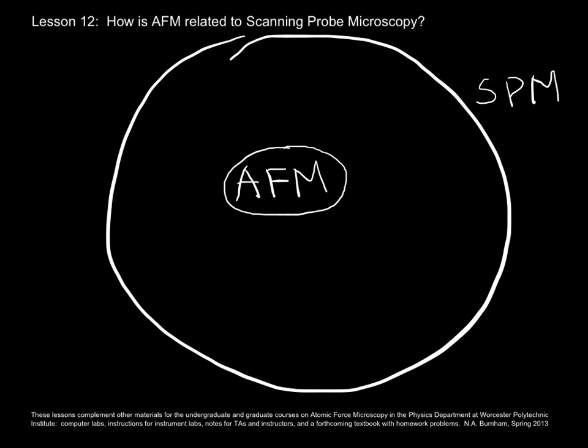Turns out AFM is the most popular for many of the reasons I mentioned in Lesson 5. It works in many environments. It works on a lot of different types of samples. It's not too expensive, etc., etc.